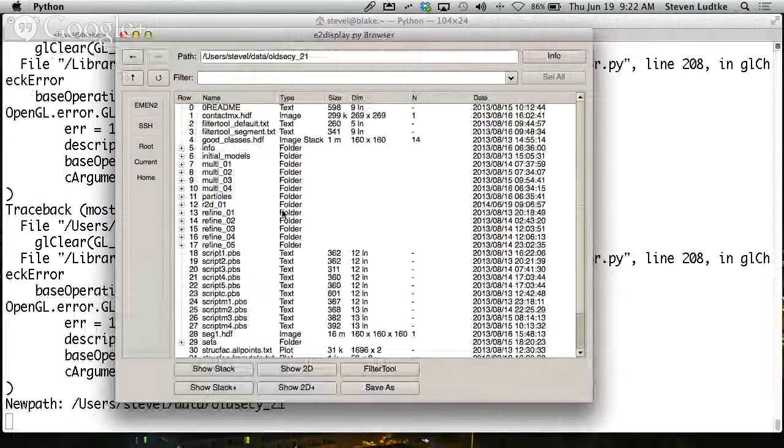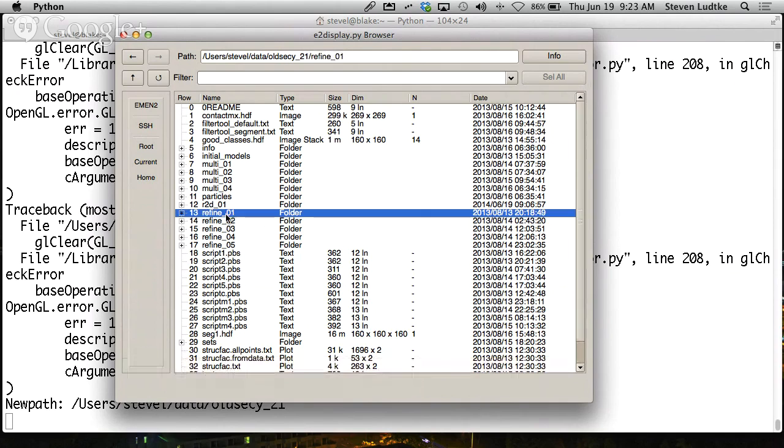All right. So that finishes the R2D01 directory. I think I discussed initial models pretty well in the previous tutorial. I don't want to go back and do it again. Some of it was probably already recorded this morning, so I'm not going to redo that again. If you have any questions about the initial model output files, feel free to ask them or email them to me later. Okay, the next directory we'll take a look at then is one of the refined directories.